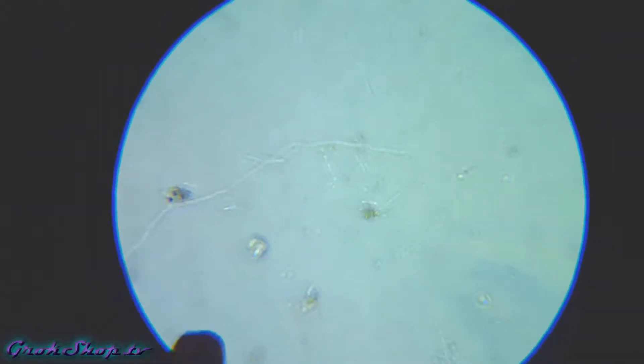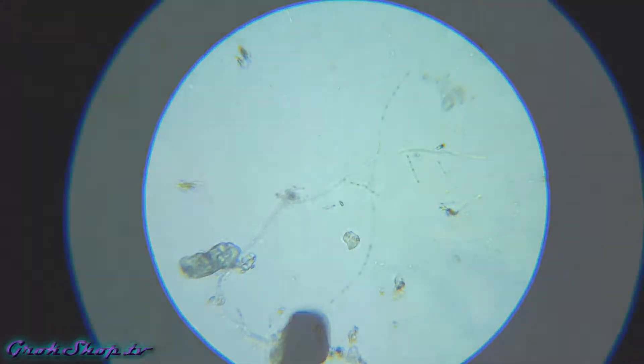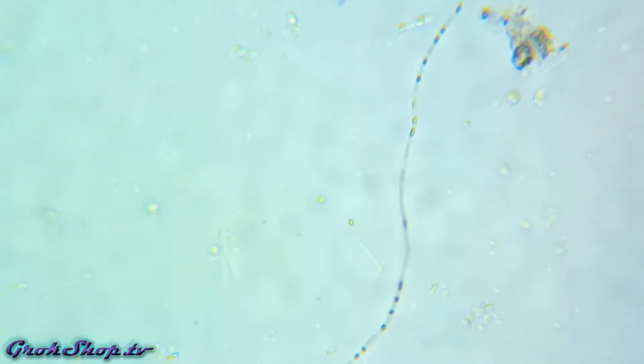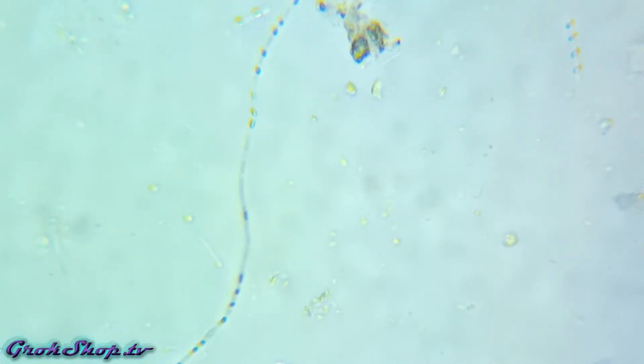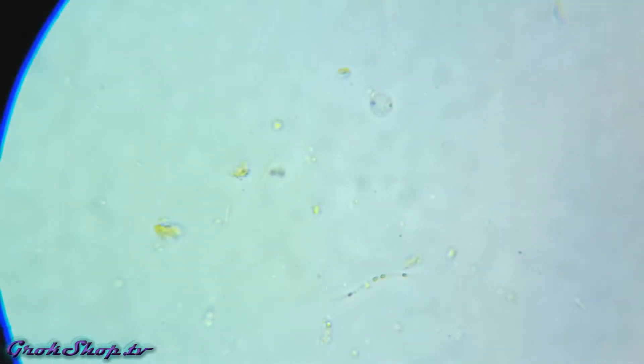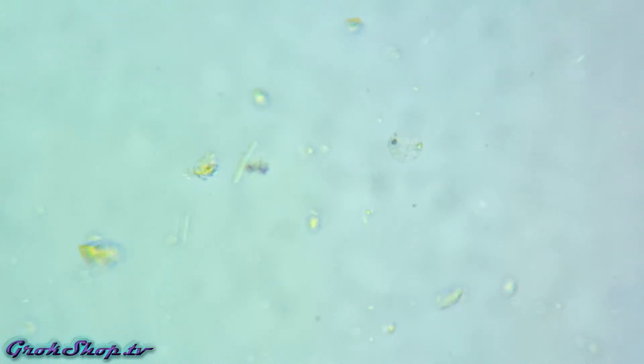Here's a nice long strand of fungal hyphae. Now that's what I call a piece of bacteria - it's a pretty long sausage-link non-motile bacteria there. And here we have one of our nice globe flagellates, or spherical flagellates. Could very well be a volvox, which is a kind of algae very common in fresh water and compost.